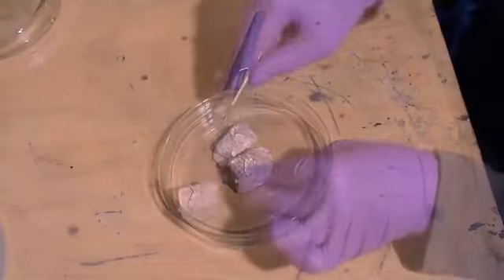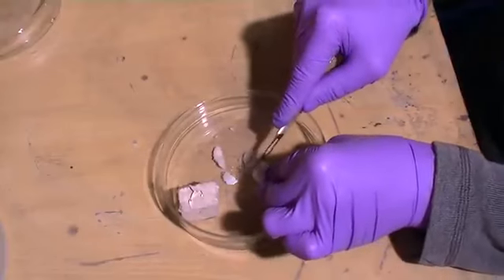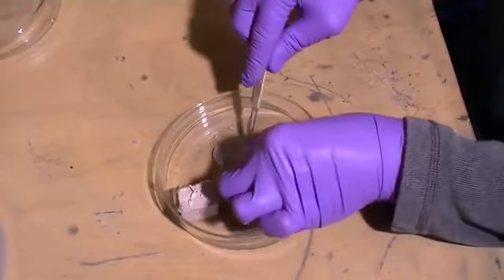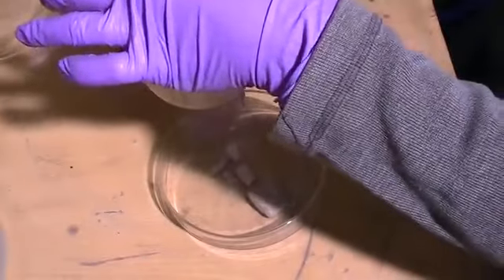Since sodium metal is reactive, for the first set of experiments we're going to perform, we're only going to use a small amount of sodium metal. The larger pieces of sodium metal we're going to store back under the mineral oil until we experiment with those later.